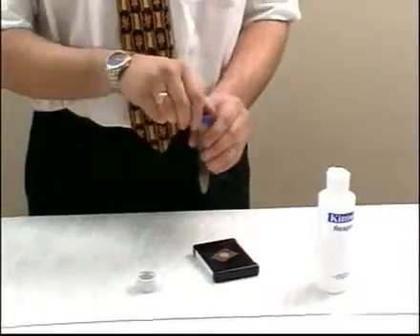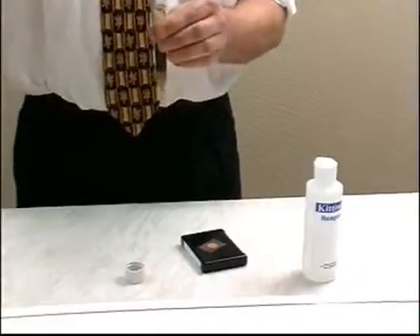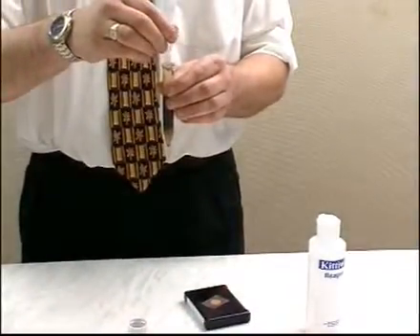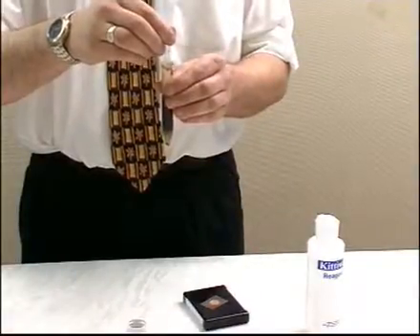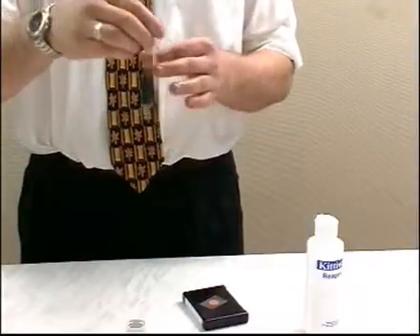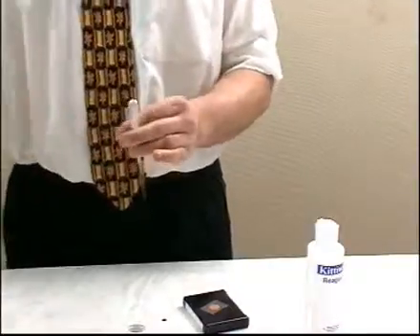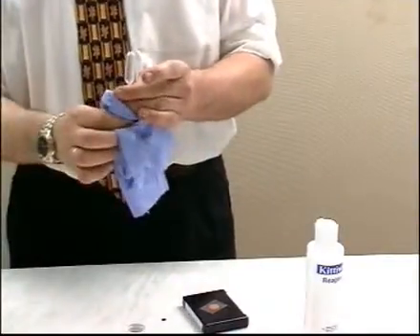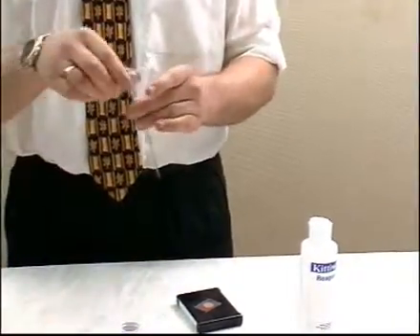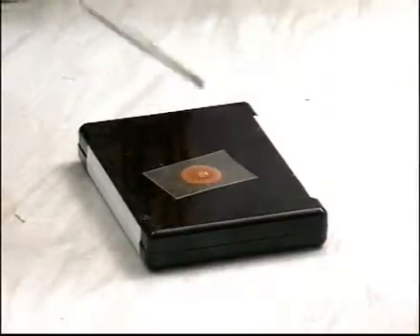Flush the pipette with reagent H, then draw off a sample of the water layer in the test tube. Wipe off any oil and squeeze a few drops of water back into the test tube, then place the next drop of water onto the test pad and leave it for five minutes.